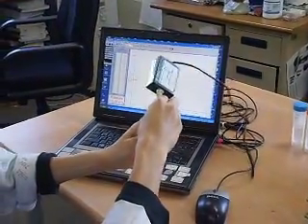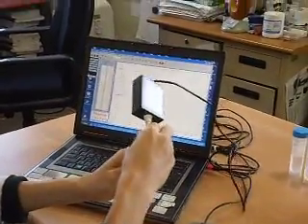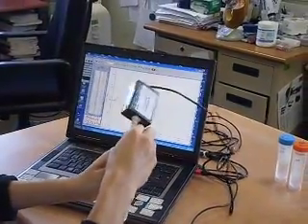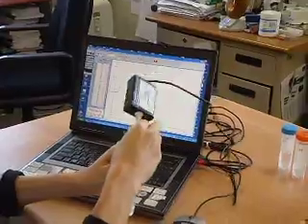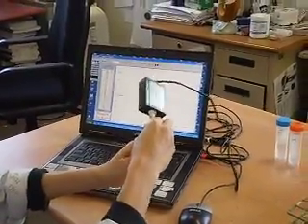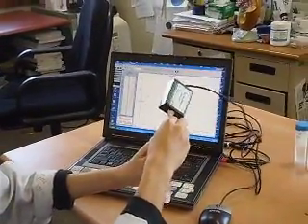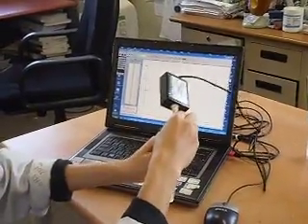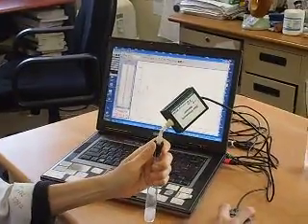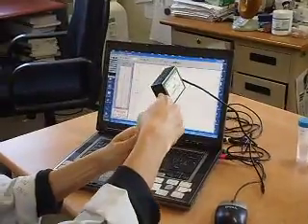We are going to do data recording probably for the first 100 seconds. We want to measure the initial rate of reaction. This is the initial rate, because as the reaction proceeds, it will slow down as the magnesium is being used up. So I'm going to stop the reaction after probably 90 seconds. Stop. Okay, I stop my data collection now. Done.